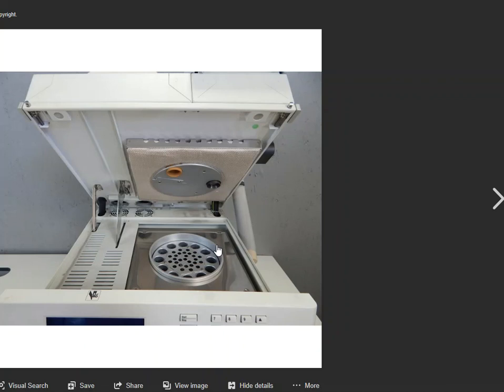If so, that's going to expand your run times another 10 minutes because you've told this instrument to heat the sample for 10 minutes. So this thing is smart enough to know, listen, if the run time is 5 minutes, what I could do is bring another sample in. I could go ahead and start this heating process. And as this sample is heating, I get a head start. And by the time this second sample is finished, the GC box will be finished with its run, and it will be automatically ready for the sample because now I can send that sample directly to it. There's no more wait time in the middle of this.